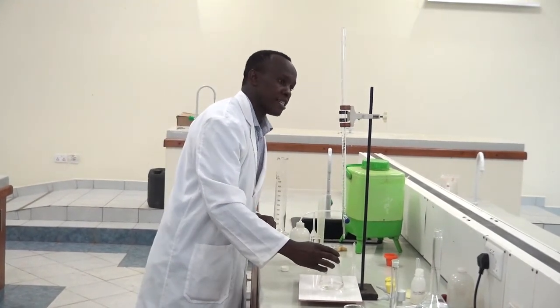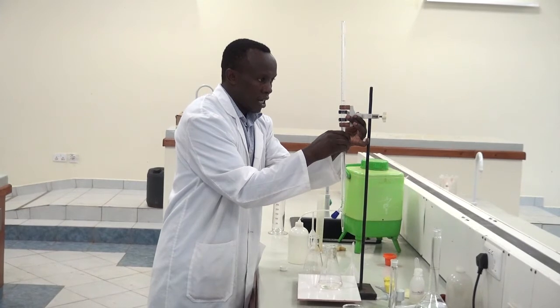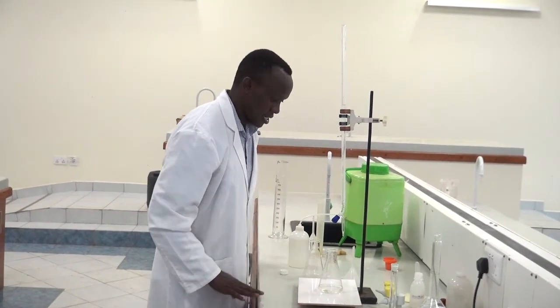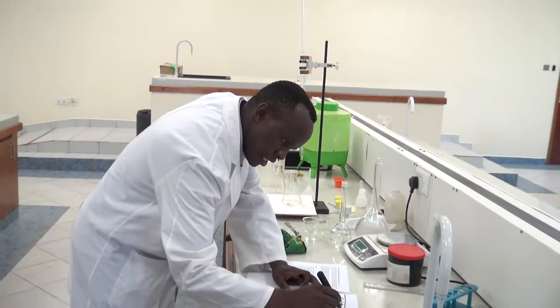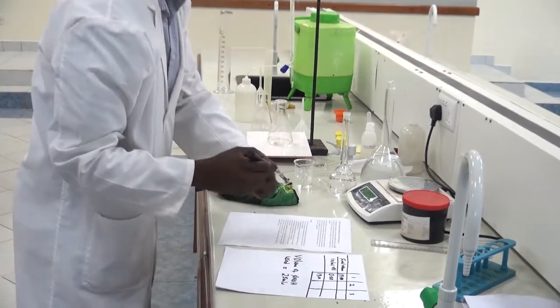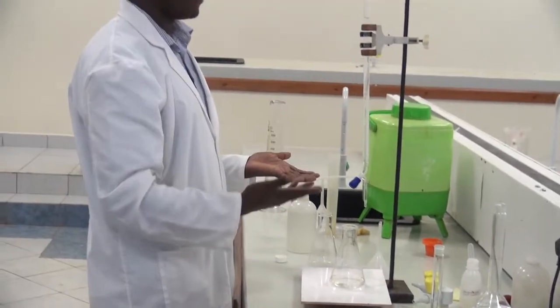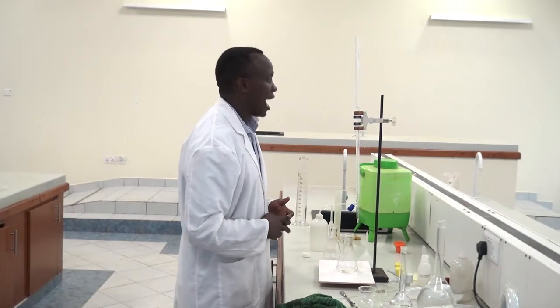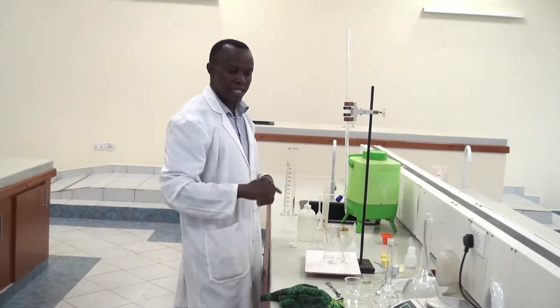I have to take the burette reading, and my endpoint is at 19. So I record that. I started at 0.0, the endpoint has been reached at 19.00, so my titer value is 19.00. Since the burette holds a maximum of 50 and I've only used 19, I can continue from where I have left, or I can opt to refill my burette to zero. For this case, since the volume is still within the range, I'll just continue from there.